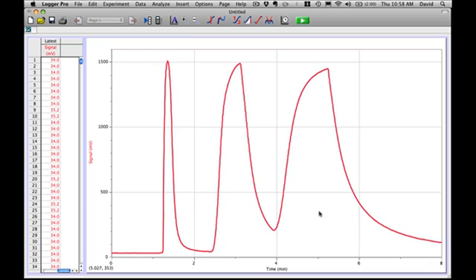One note, all of this can be done on a LabQuest and it would be operating the same way and the plot would look the same. It would just be a smaller screen. So a LabQuest runs the same way with the Mini-GC.